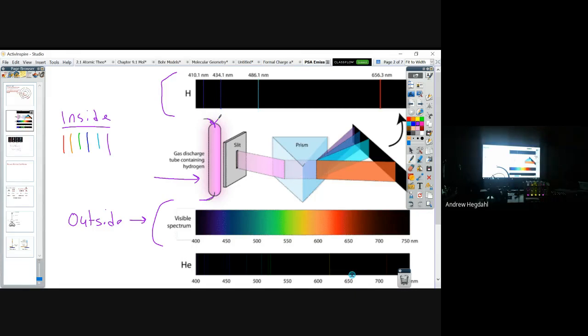This is also used, a flame test, and more specifically, like we're going to do today, is used to identify heavy metals that might be in soil. So in urban development, you may have had like an industrial park or something like that. But now the city is growing and we want to make it a residential area. So what they would do, once they've torn down all of the industrial buildings, is they have to do some soil testing to make sure there's no mercury or extra lead in the places where people want to build their houses, right? Because then that stuff accumulates in your body. You wouldn't want people living there where there's all sorts of mercury, because that gives people cancer and diseases.